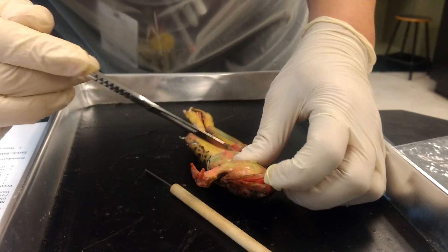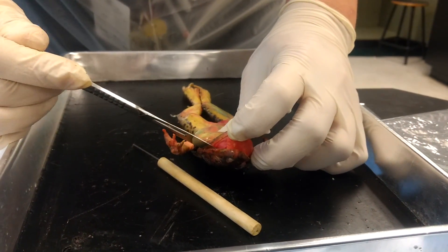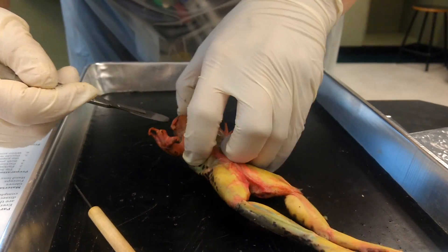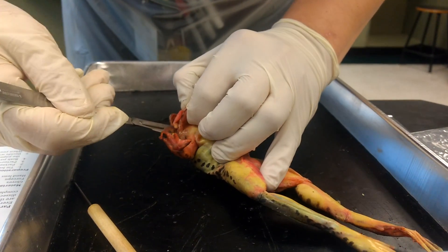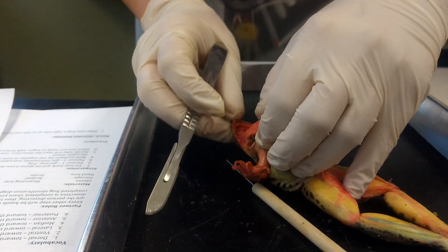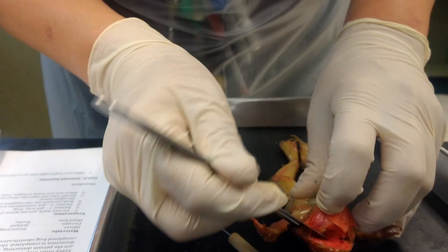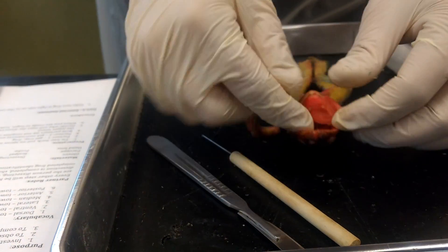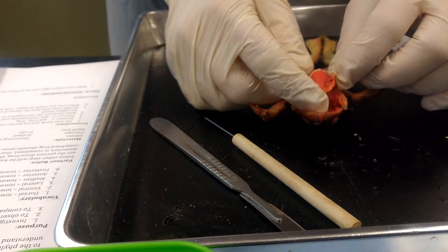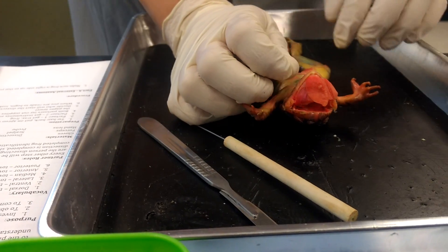Carefully slit along the jawline — you're going to feel the bone kind of pop a little bit, then slit along. I would prefer you cut away from yourself, not towards yourself, and notice how my fingers are kept far away. Once you've opened it up, you can open it a little more. The tongue itself starts to flip out. Make sure you have completed numbers two and three.